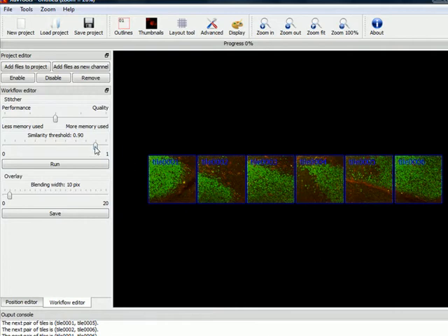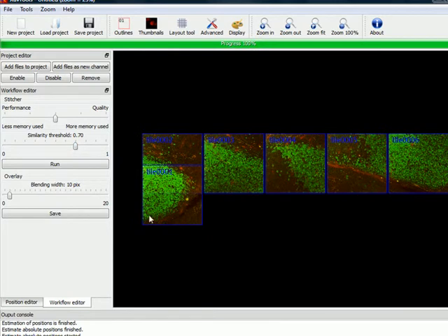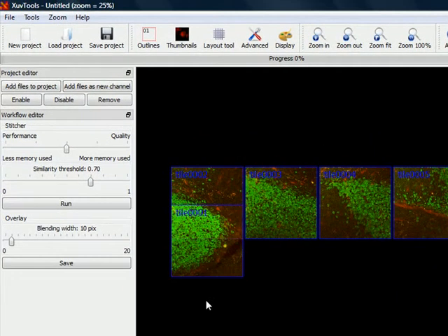Let's go back to the similarity threshold. The setting of 0.9 means that you only accept the best possible matches. Let's decrease it a little bit to 0.8. Still no stacks match with such a high similarity threshold. Okay, we go down more, and suddenly the first pair appears that matches with 0.7 similarity threshold.